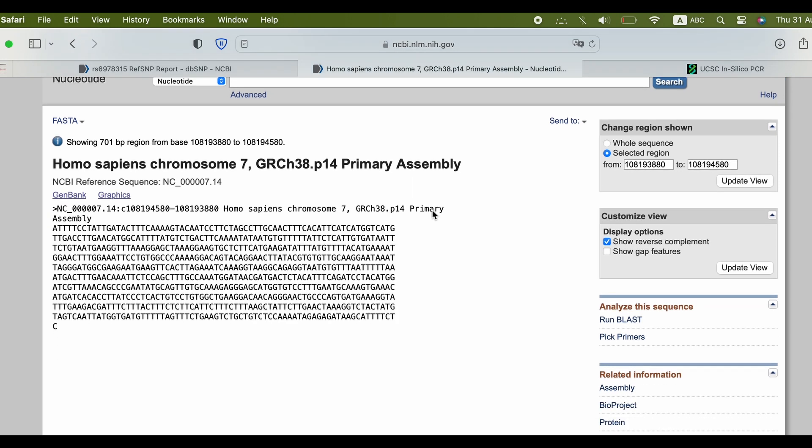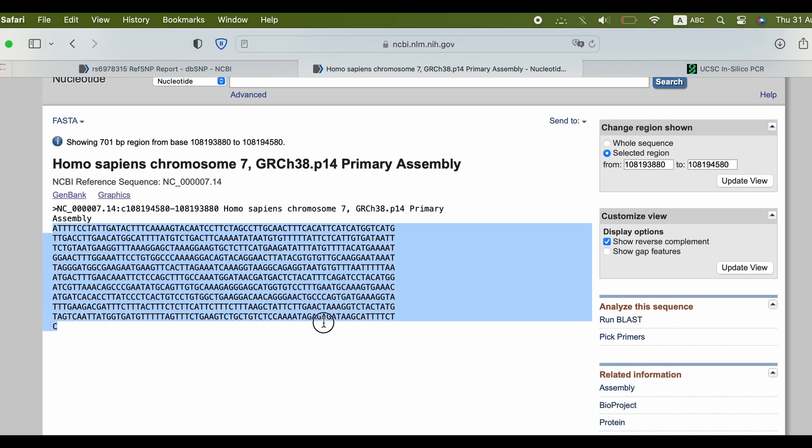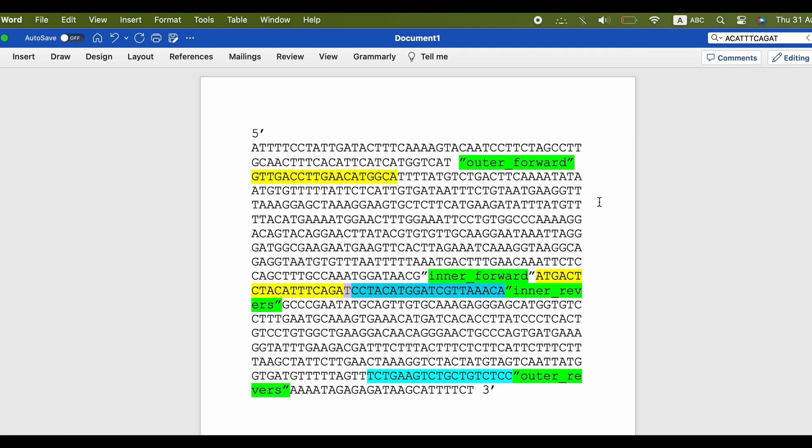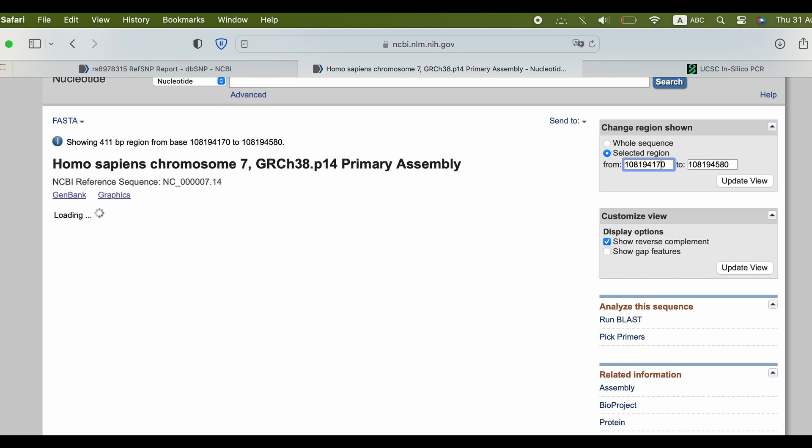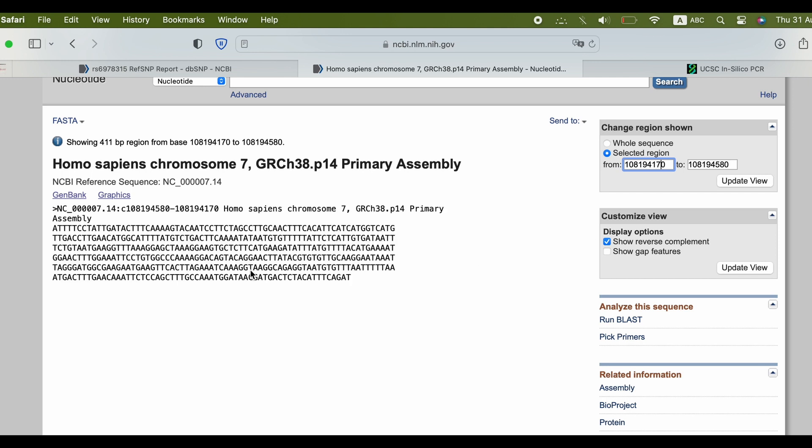Copy the sequence and paste it in a Word file. To find the SNP add ten bases beside the position, as you see, and then use search in Word to find the SNP.